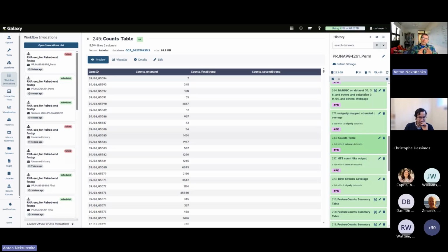For those of you from the fungal community, you might feel like, oh God, this is yet another thing I need to learn. Since this webinar series is called Tools of the Future, this is where we're going. So Claude Code in this case integrates with Galaxy, so you can essentially orchestrate things in Galaxy from Claude Code.